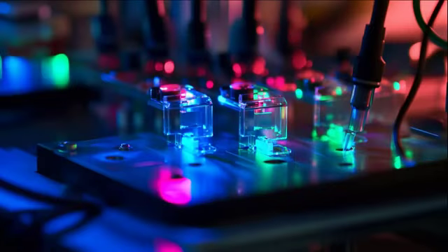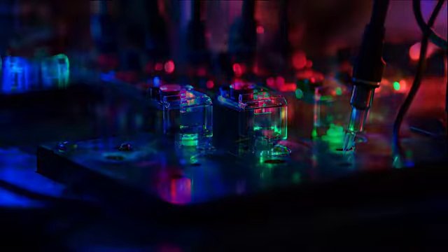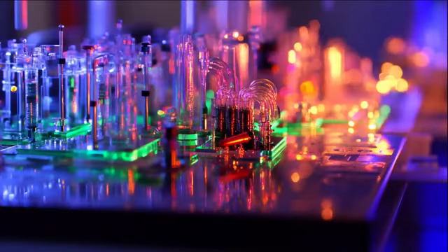Combining multiple separation techniques on a single lab-on-a-chip platform enhances the resolution of complex mixtures. For example, a chip may sequentially employ electrophoresis and microfluidic chromatography to isolate compounds, much like using a series of increasingly fine sieves to progressively refine a raw material.